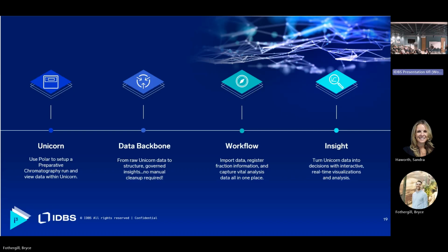It's not a roadmap item. We actually did it about 5 years ago, I think. Originally this was something we worked on with TetraScience in collaboration. Myself and some developers at TetraScience worked together to build this connector. Originally it was done just as a POC.